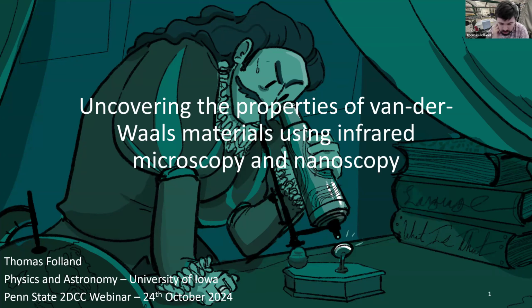So today I'm going to be telling you about one of the things that my group studies, which is understanding the properties of van-der-Waals materials using infrared microscopy and nanoscopy. I'm actually going to start with a general, broad overview of what optical spectroscopy and infrared spectroscopy can tell us about the properties of van-der-Waals materials, and why van-der-Waals materials are particularly interesting in terms of their optical properties.